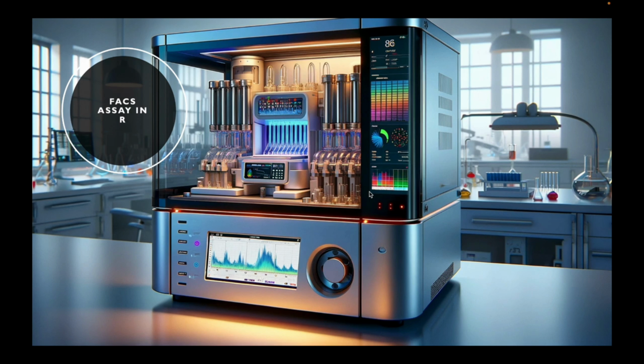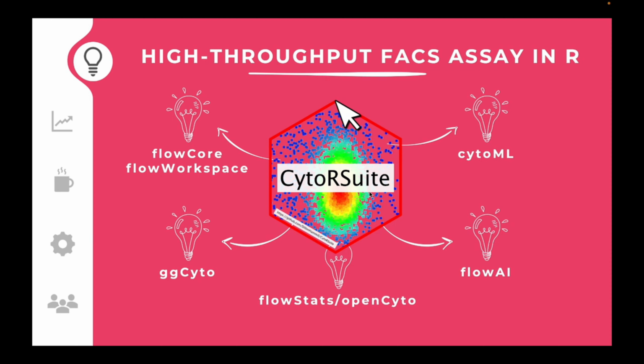So we are going to deal with the FACS dataset in R programming language. You need these packages such as FlowCore, FlowWorkspace, CytoML, ggCyto, FlowAI, FlowStats, and eventually you can also use the CytoRSuite, which will help you to analyze your data sets very interactively. But we'll be dealing with all the options out here, and then we can analyze our data sets.